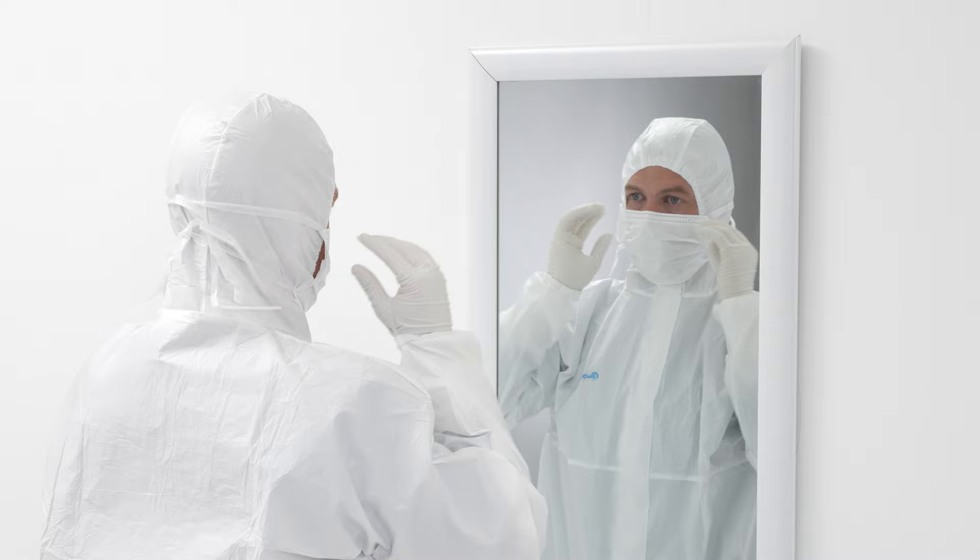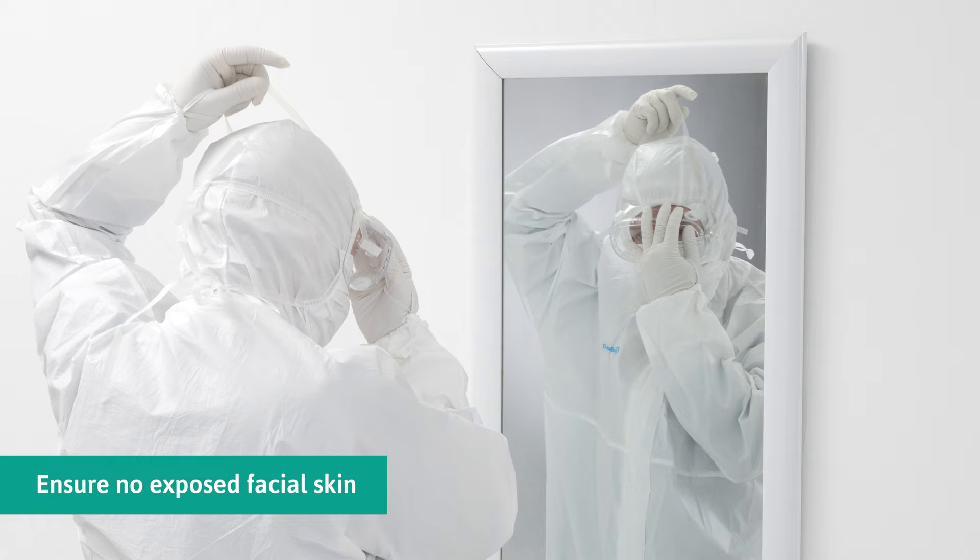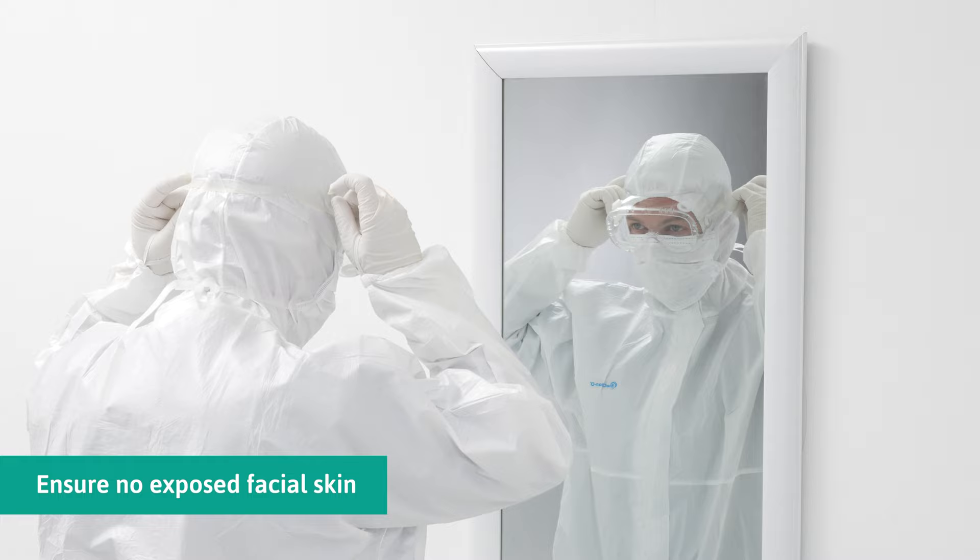Tie the straps of the face mask around the hood and adjust for a good seal. Pull the goggles headband over the hood. Adjust the goggles to ensure no exposed skin, and tighten the headband for a secure fit.